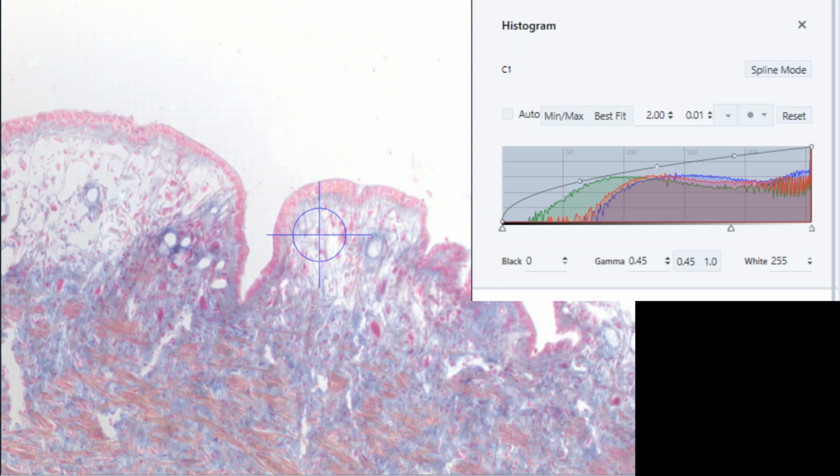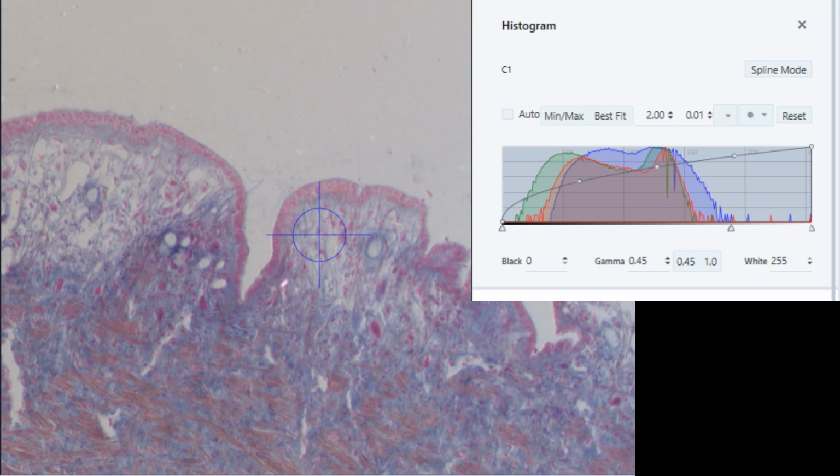So once you've done the exposure and you've set the white balance, you need to leave that white balance, leave the brightness at that position. If you start changing the brightness, you'll change the white balance or the colour balance, and you'll have to do it again. Here we did it using a part of the sample. That's quite an acceptable way to do it. Or you can take the sample away, just use a neutral colour, but then you're changing the brightness as well, possibly. So I prefer to do it using the sample and find an area on the sample that is neutral or white, and use that to do the white balance.